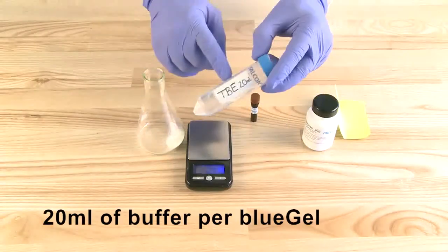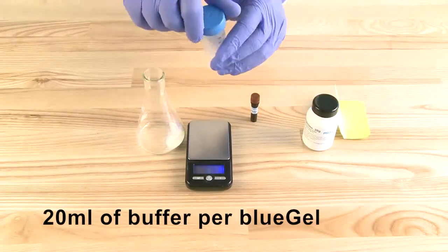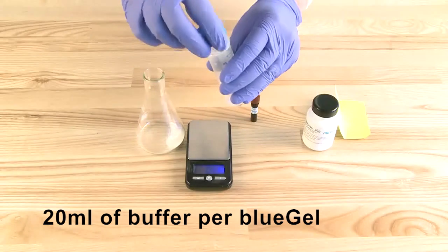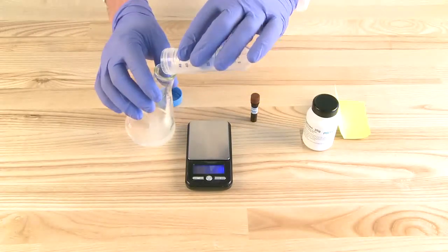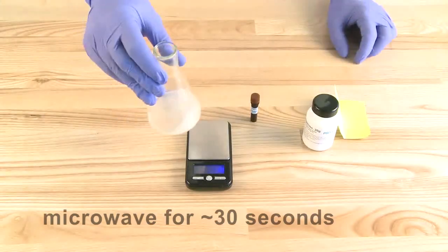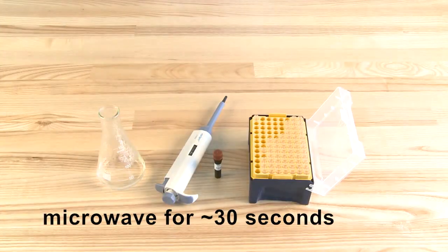Place the agarose in the flask and add 20 milliliters of running buffer. Swirl to mix the agarose. Place in a microwave for approximately 30 seconds or place on a hot plate.